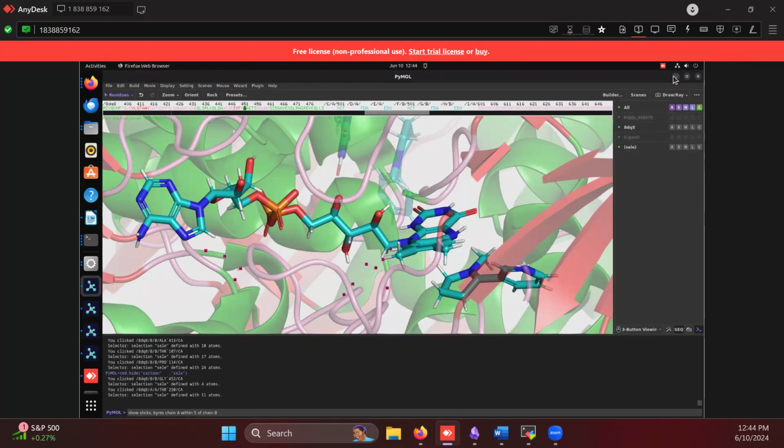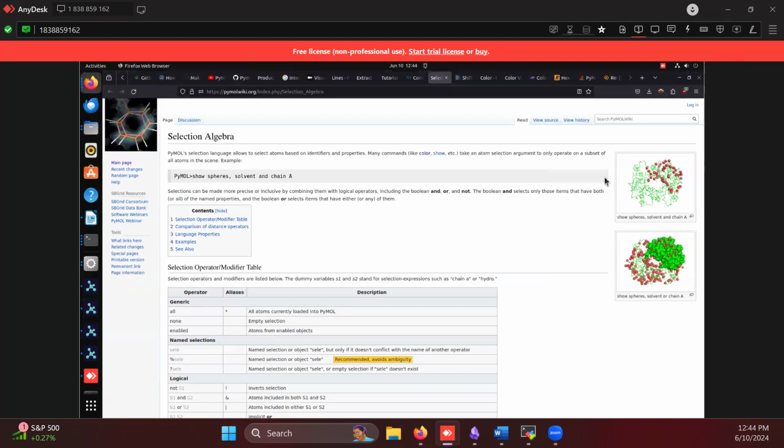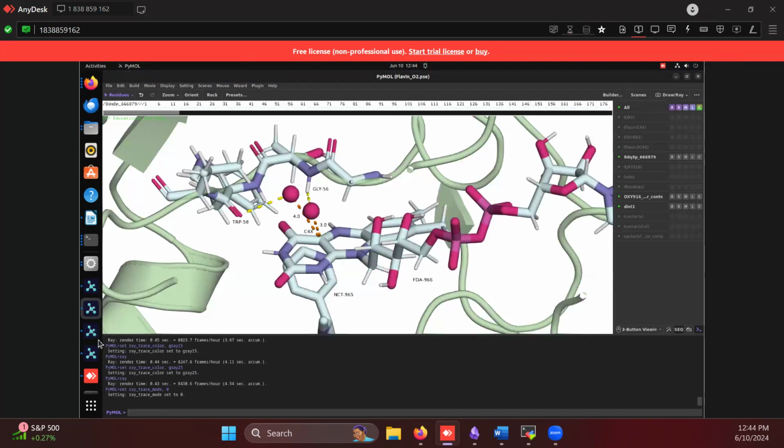Do you have questions? Not really, but I have a question about PyMol because I'm usually using ChimeraX. They support making different rotamers for the side chain. Is there a similar function in PyMol? Rotamers for side chains, right? I think that is something you can do with the mutagenesis tool.